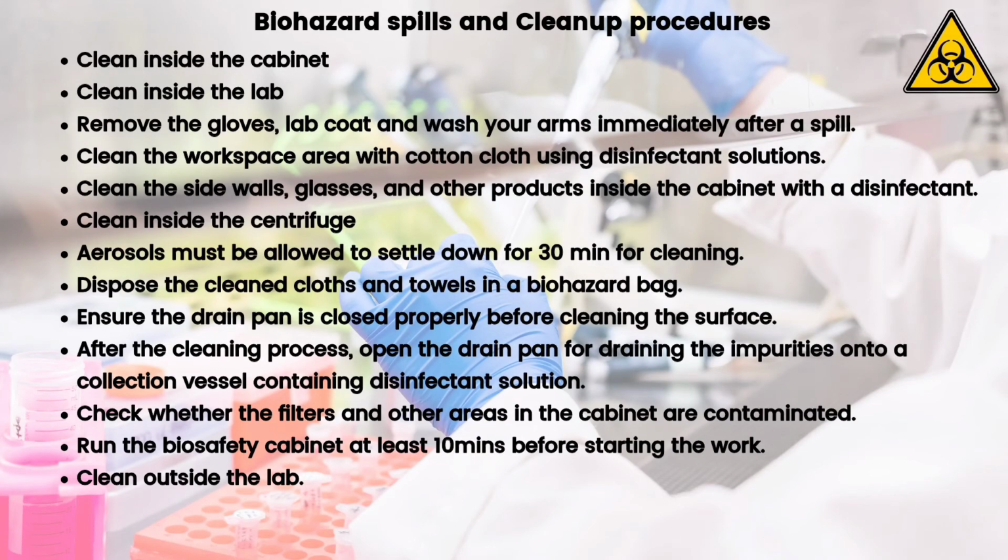Clean the workspace area with cotton cloth using disinfectant solutions. Clean the side walls, glasses and other products inside the cabinet with a disinfectant. Inside the centrifuge, aerosol generating devices like the centrifuge and pipette trays also should be cleaned. Aerosols must be allowed to settle down for 30 minutes before cleaning. Dispose of the cleaned clothes and towels in a biohazard bag.